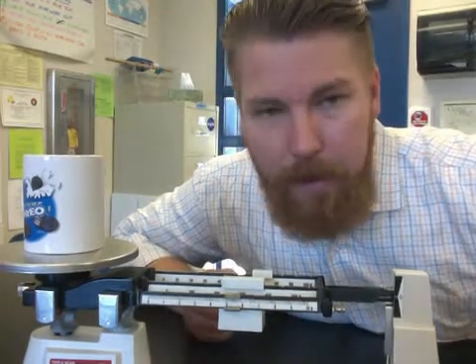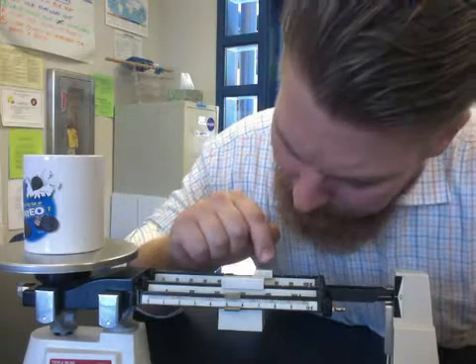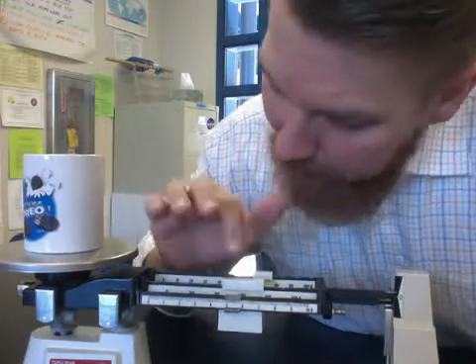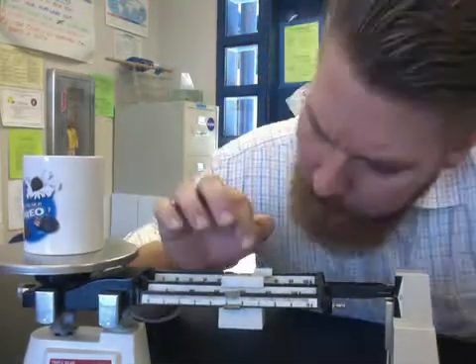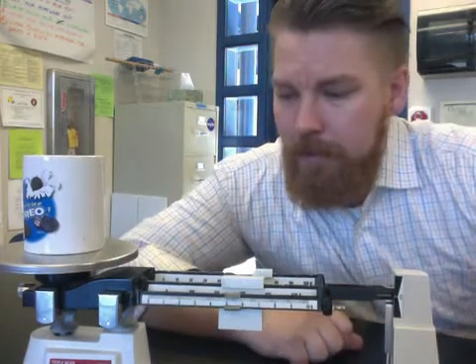How do we read it? You start with the 100-gram weight — ours is at 300, so you write 3. Next, look at the 10-gram weight — ours is at 70, so our object is 370-something grams, write 7. Then look at the 1-gram weight — ours is at 5.4. So we write our whole mass as 375.4. Make sure you write grams afterwards so I know you don't mean kilograms or milligrams — always put a little g for grams. And you're done!